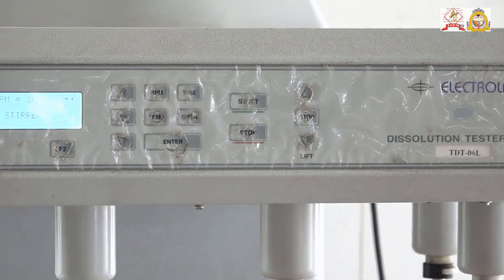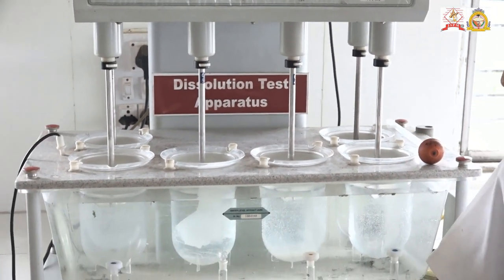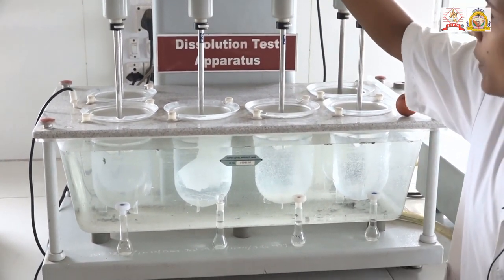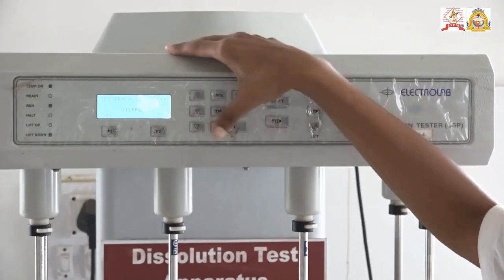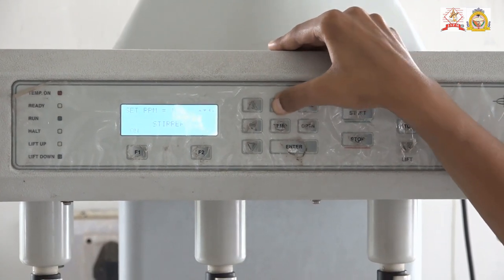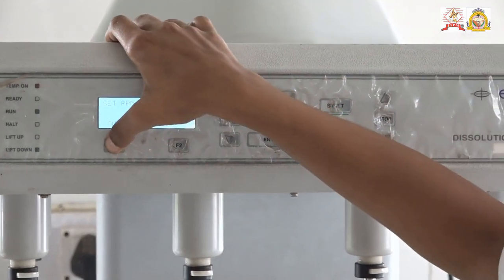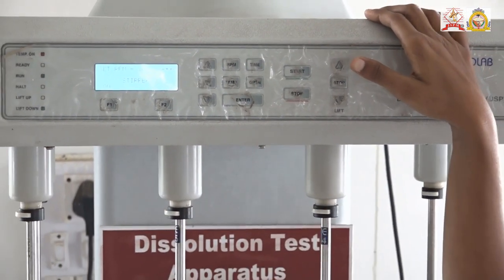In these jars, dissolution media of 900 ml is placed and the tablets are placed in the dissolution media. Now set the temperature and RPM by these switches, then turn the motor on and it will start the rotation of the paddles.